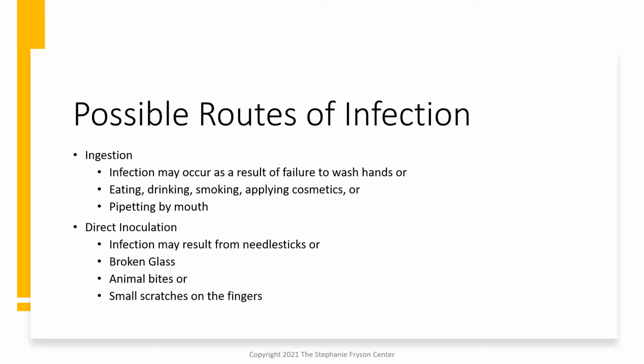The alternative to that is you work in the laboratory and you work by yourself. So you decide you want to eat, drink, smoke, and apply cosmetics within the laboratory. You can get an infection that way. This is why those are things that you should never do in the laboratory. Eating, drinking, smoking, applying cosmetics, including lip balm, are not allowed in the laboratory. And of course, mouth pipetting is not allowed.